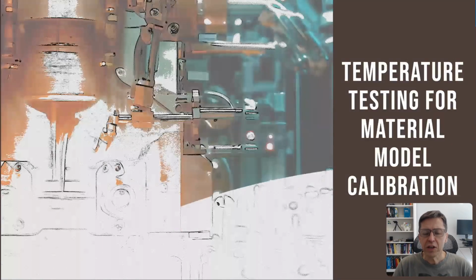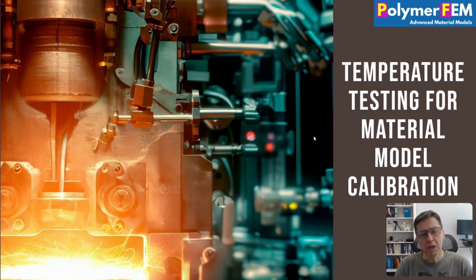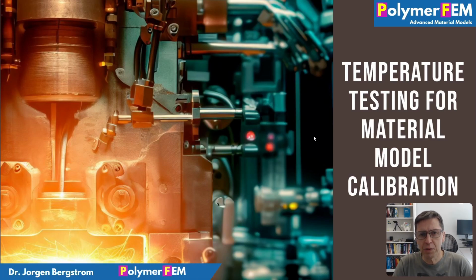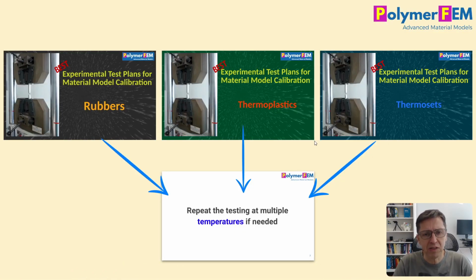Hi, today I'm going to talk about what type of experimental testing you need to do if you want to calibrate a temperature-dependent material model for a material. In the past, I've developed test plans that I've presented in different videos for how to test a rubber, a thermoplastic, or a thermoset, different types of polymer studies, for material model calibration.